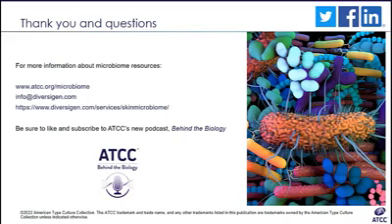Yeah, that's a great question. The case studies and different applications for full-length 16S sequencing, I would say, can go from very simple to more complex. And again, the main aim of sequencing the full 16S gene is to get species-level resolution. So one example that comes to mind, and I talk about it in the webinar a little bit, is developing therapeutics for dermal conditions like acne, which we know is caused for the most part by C. acnes. So to develop a therapeutic to treat dermal conditions like acne, you need to know the exact organism that is causing the disease to have better outcomes.